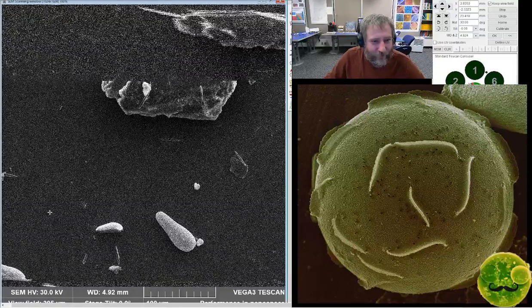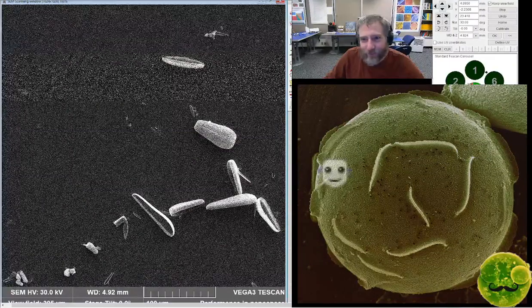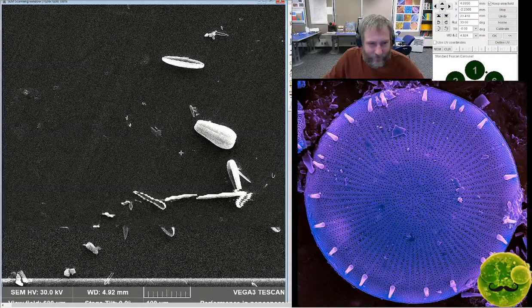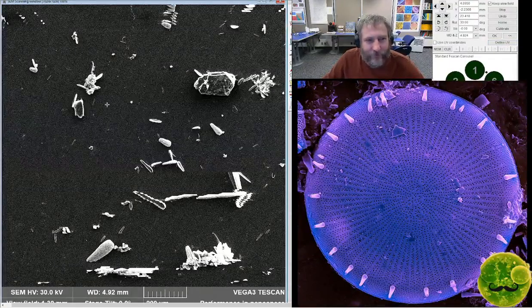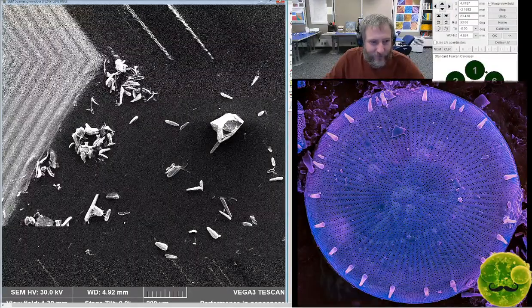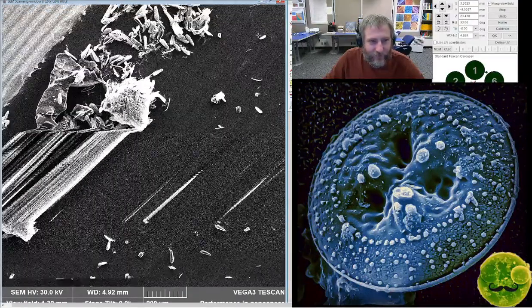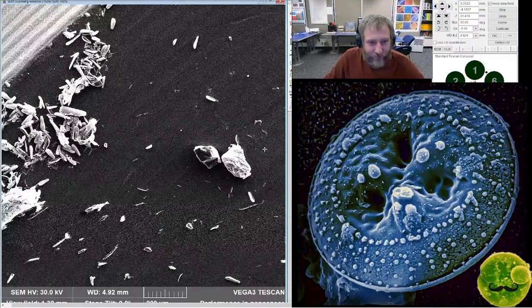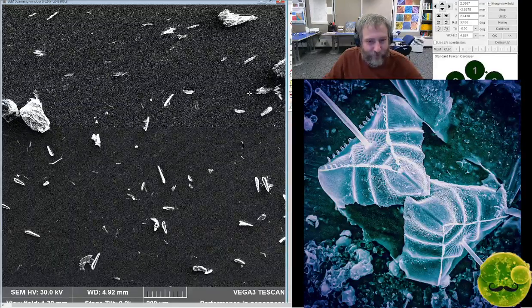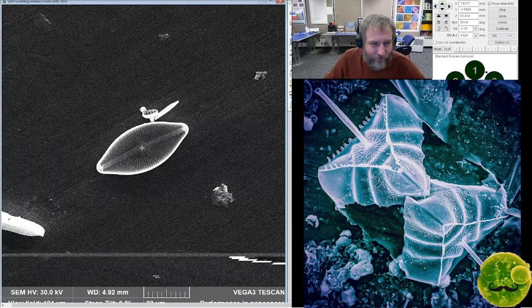Okay, I think we got a good idea of what this thing is. And let's see. I'm going to do this. And I'm just going to do a quick scope around to see if there's any other Afrocymbella on this slide, stub, that are not this little thing that I'm looking at. I feel like it's going to have to get moved from Gomphonema if it's in Gomphonema eventually, but for now it's probably a Gomphonema. Oh, a cool Stephanodiscus.